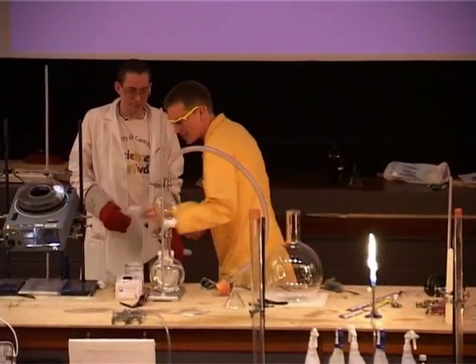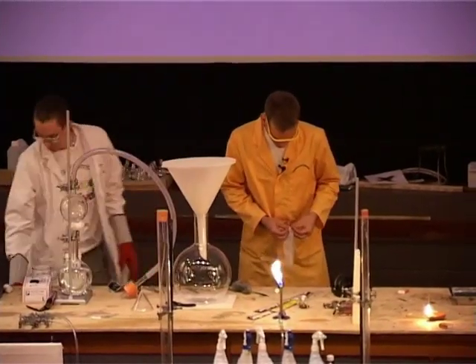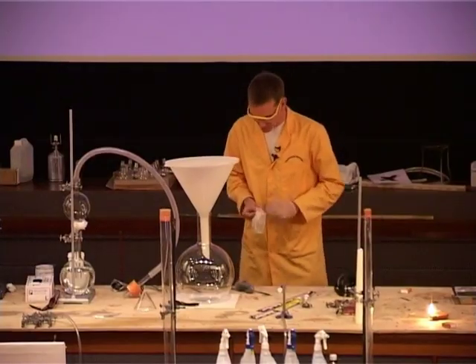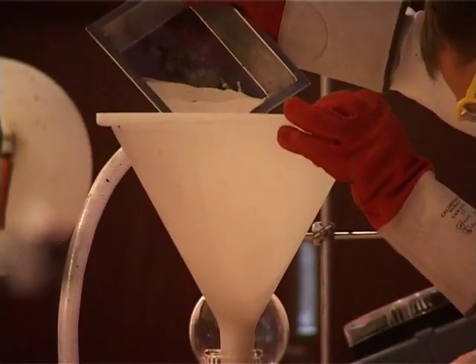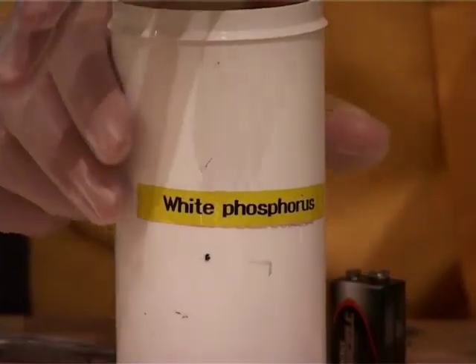So, I'm going to get some phosphorus in a second. It's really rather unpleasant stuff, so I need to put on my gloves here. And Mark is going to bring some warm sand. We've had some sand warming up just in the corner there. Let's get the phosphorus out.